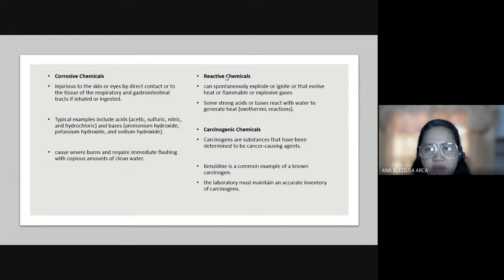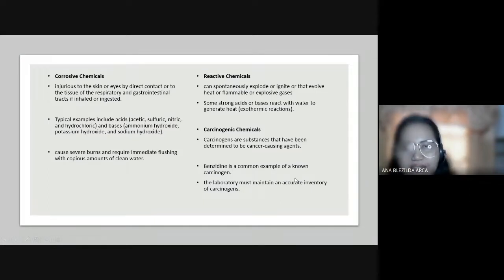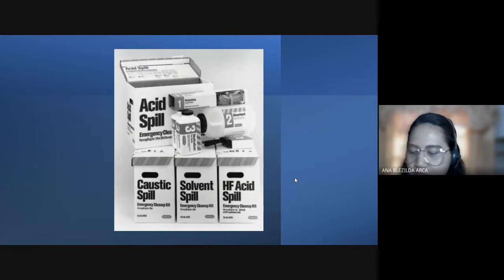Okay? So that is why in the laboratory, meron tayong mga rotation, 'di ba? Hindi ka pinapatagal sa histopath. Kasi kapag matagal ka na sa histopathology section, masyado ka na-expose sa mga carcinogens, 'di ba? So pwede kang magka-cancer. Kaya nga naman yung histopath na 'yan, every month dapat may mga staff diyan na nag-rotate. Pinapalitan talaga, may rotation yan. That's an example on how to mitigate the hazards, okay? So example of this one is the benzidine, common example of a known carcinogen.